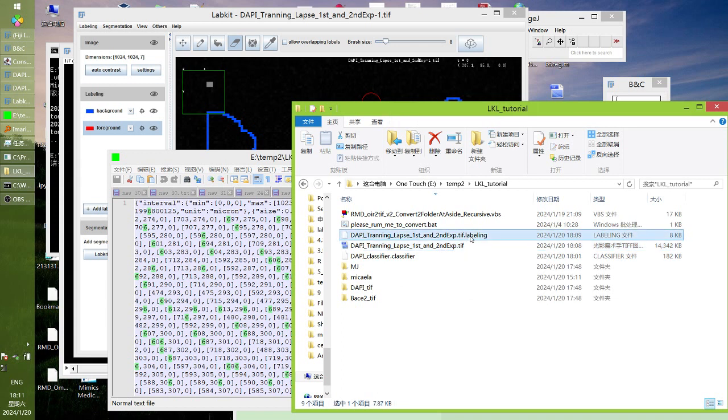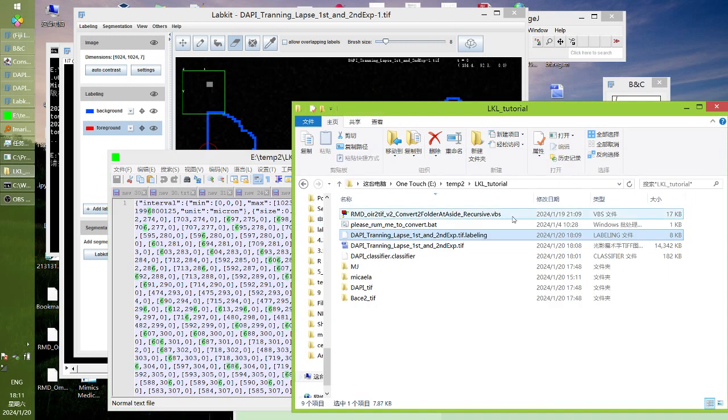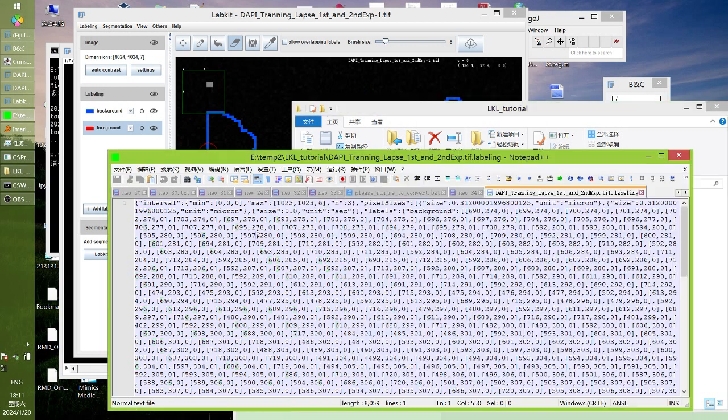We use Notepad++. It is free software; you can Google, download and install. You can drag this open, and change the max to the final merged number. How many slices or time frames? What's the number? So the count is 6, meaning there are 7 time points.